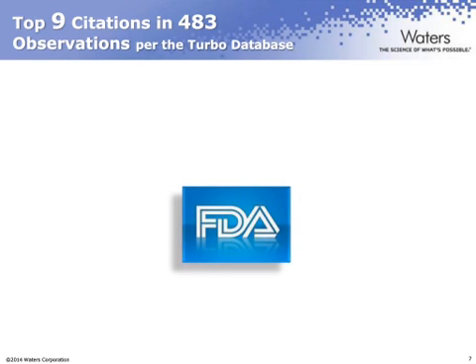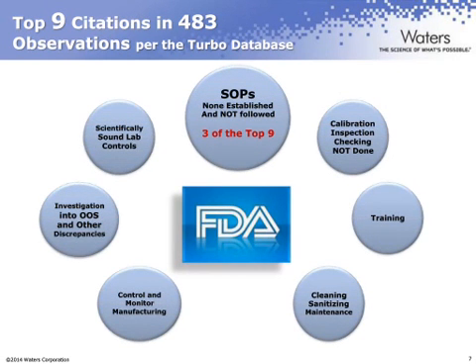The FDA do publish in a number of different ways their observations in order to better educate the entire market. One of those is through something called the Turbo database, which is available on the FDA.gov website. Here they provide a summary of the 483 observations that their investigators have observed over the past year. If we look at the top 9 citations in that list, 3 of those are around SOPs, which are either not established or not followed correctly. So it's very clear that despite whatever instrumentation or software or any other equipment that you have, it's how you use it and how the SOPs are followed, which is very important.